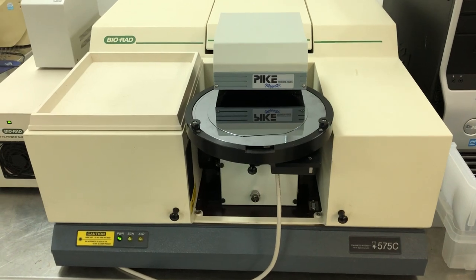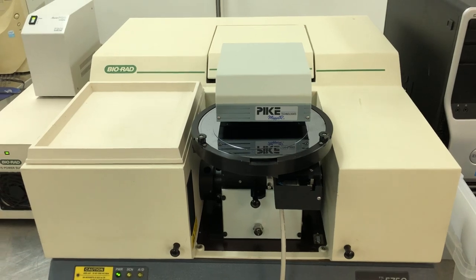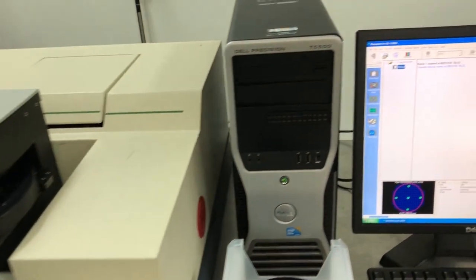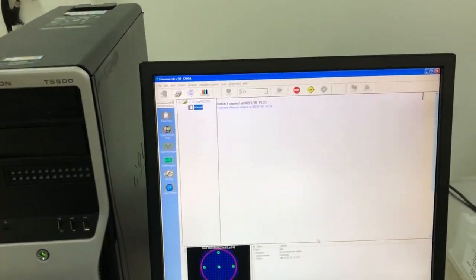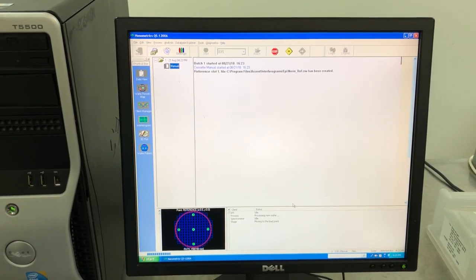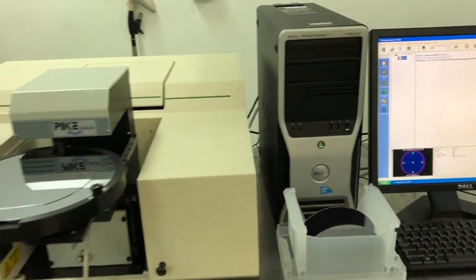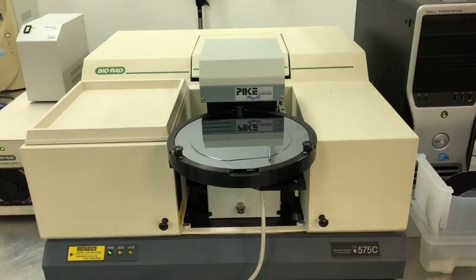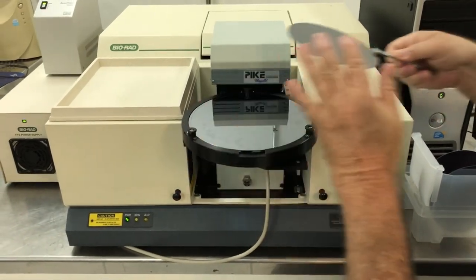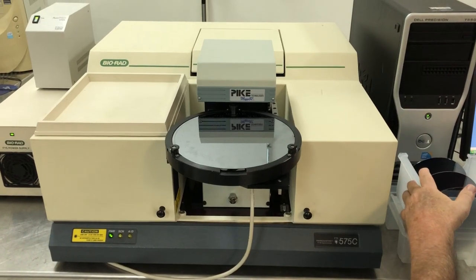It allows us to use known value Epi thicknesses. As that was analyzed, we'll get that message back from the computer. What do you want — the 15 or the 70 micron? Fifteen. Fifteen micron Epi coming up.